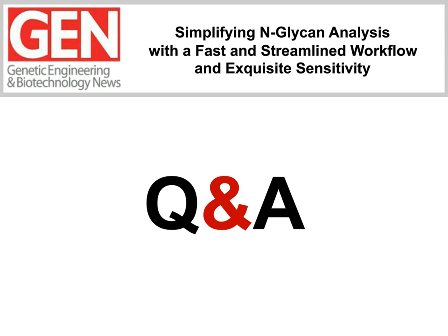That is a very good question. We have spent a very significant amount of time studying rapid tagging reactions. I would point out that what we're targeting on the glycan is the same exact residue, no matter the different complexity or chemical characteristic of the individual N-glycans, and that is an N-glycan terminated with a GlcNAc residue and having a beta-glycosylamine. In addition, it is worthwhile to understand that we use a saturating and tightly controlled modification condition. We've also taken the time to look at what one could call unbiased views of a glycan profile, such as through glycopeptide mapping or subunit IgG glycan analysis, and what we can assure is that we've seen matching profiles for many different situations.